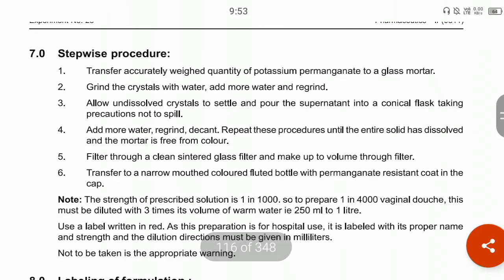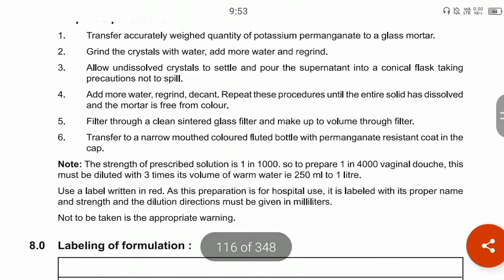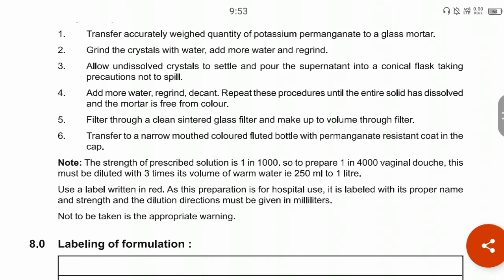The stepwise procedure: first, transfer the accurately weighed quantity of potassium permanganate to a glass mortar for trituration, then grind the crystals with addition of water and regrind. Allow undissolved crystals to settle and pour the supernatant into a conical flask, taking precautions not to spill. Add more water and regrind the remaining undissolved crystals. Repeat this procedure until the entire solid has dissolved and the mortar is free from color.